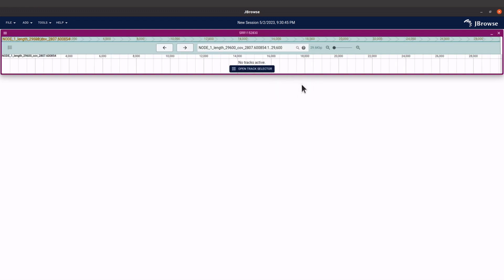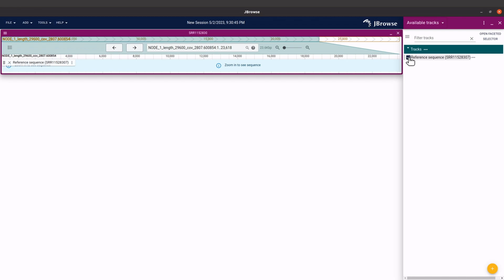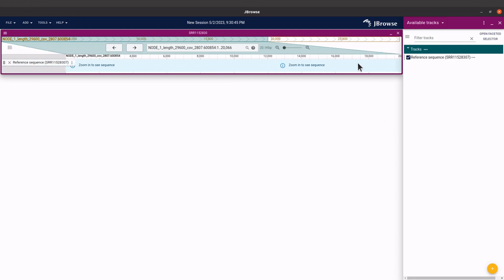At the moment we have no loaded any tracks — no tracks are active. So what you are going to do is click on the 'Open Track Selector'. You'll be shown this window, and you are going to select the tracks that we want to display. At the moment we have loaded the FNA file, that sequence, so you can click it to select it. Just check it — that's what we have to do. The name will appear on the left side, and you can drag left and right.